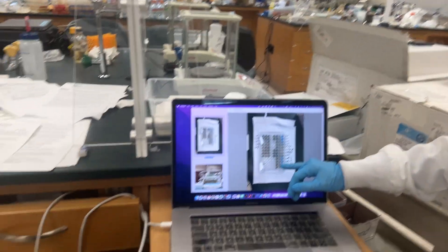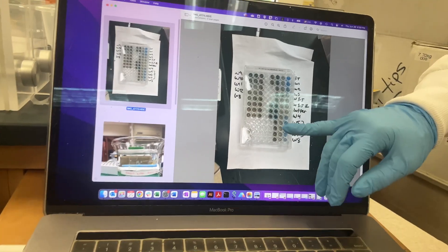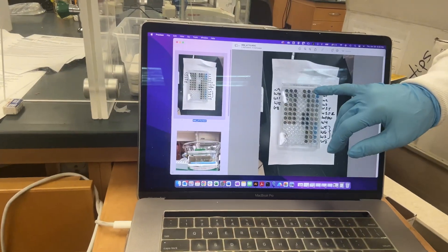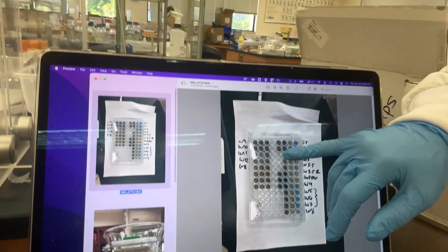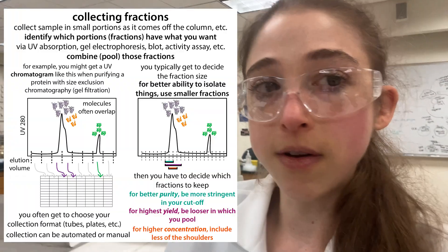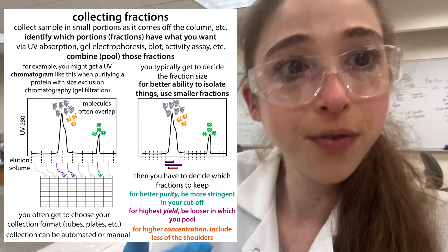So then we started ramping up the imidazole. We saw that peaks five, six, seven, and eight were where we had most of our protein, and then it started tapering off as all the protein came off - eight, nine, ten, eleven. You can see we're getting protein out until pretty much the very end, but there's a lot of protein spread over a very large volume. The problem is you don't want a very large volume, and the ones at the end have the highest concentration of imidazole. So we want to avoid a higher concentration of imidazole if possible and avoid having a super large volume if possible.